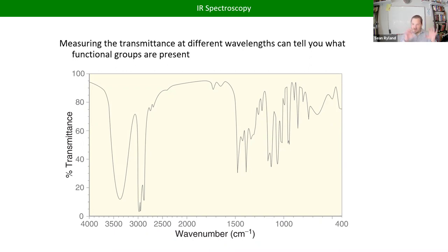And you start to be able to put together these different pieces of evidence and sort of make a case for it's this type of molecule, or this is a potential structure of this molecule. Right, so that's the goal for IR spectroscopy, is just get a list of functional groups that are probably in your compound.